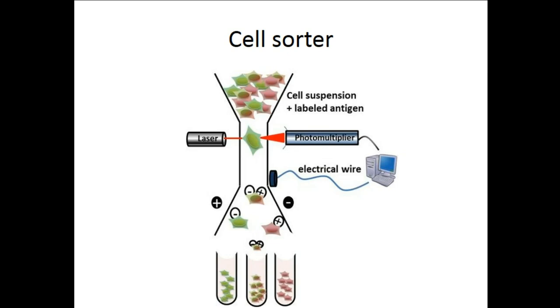Another application could be that, for instance, you're interested in a particular leukemic cell, and this will let you isolate the leukemic cell and investigate it to help in the development of a prognosis.